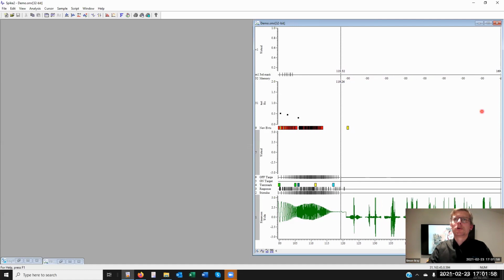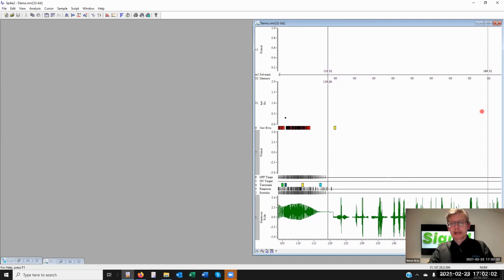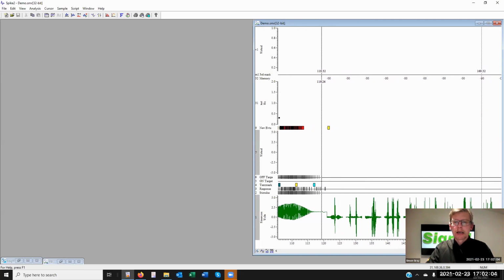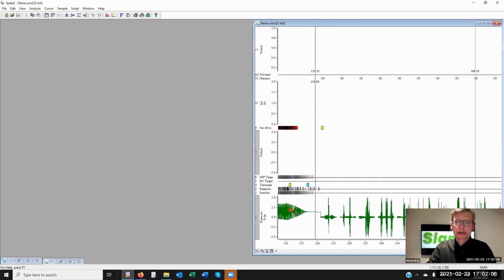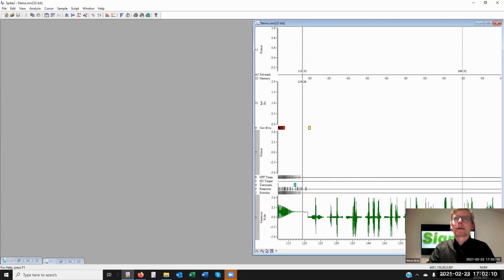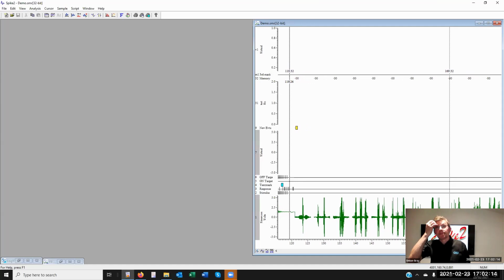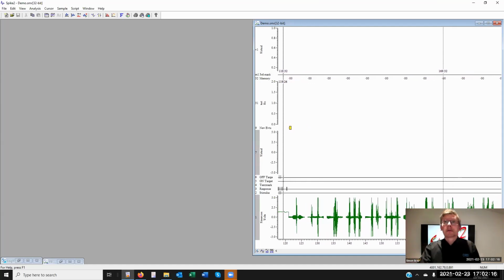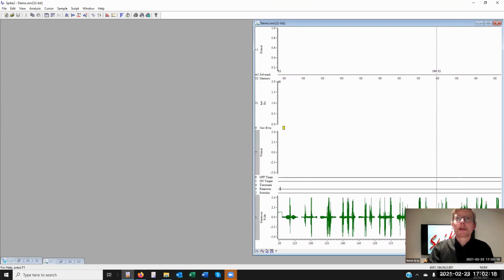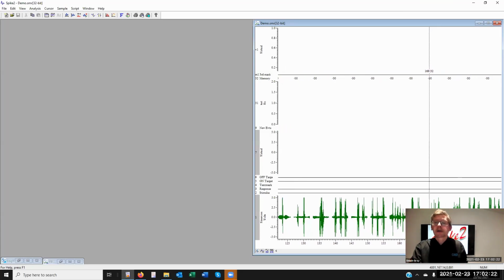But to do spectrum, I hope you've seen that already, looking at the sinusoid before. So that really is your FFT, a power spectrum. Okay, so can you tell me, Josephine, if that has answered your question, already seeing the power spectrum processing online?